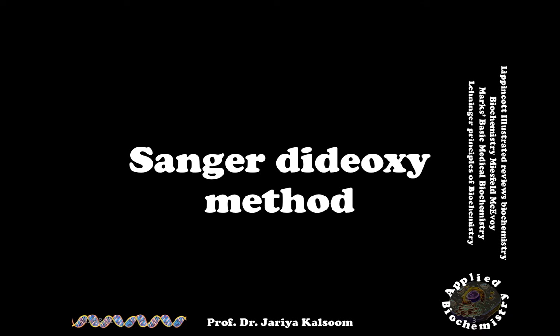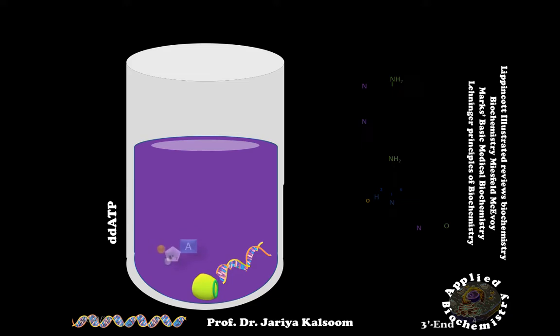The sample is divided into 4 reaction tubes and a small amount of one of the 4 dideoxynucleoside triphosphates linked to fluorescent dyes is added to each tube. In the first reaction tube, adenosine dideoxynucleotide triphosphate, ddATP, which lacks 2' and 3' hydroxyl groups, is added in little amount.